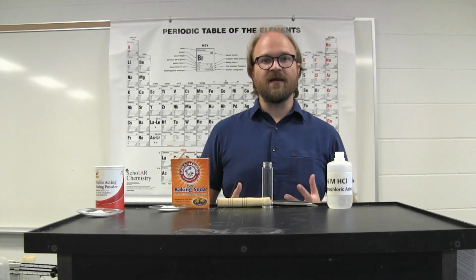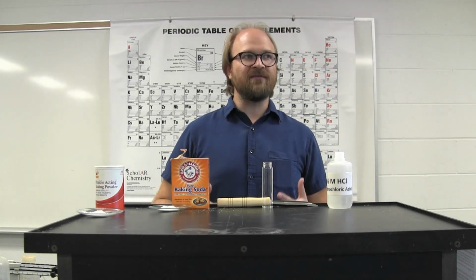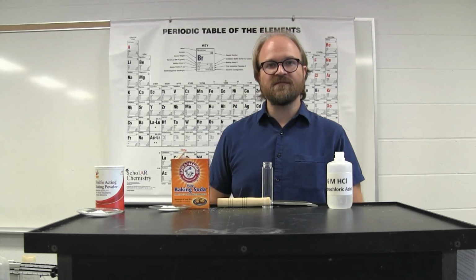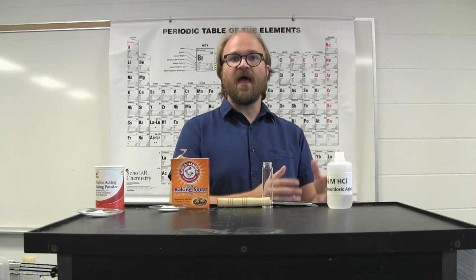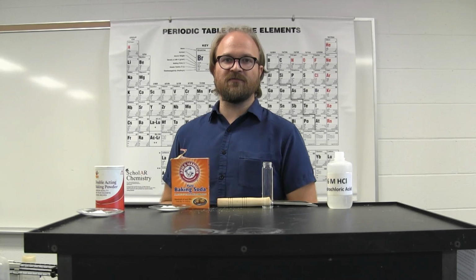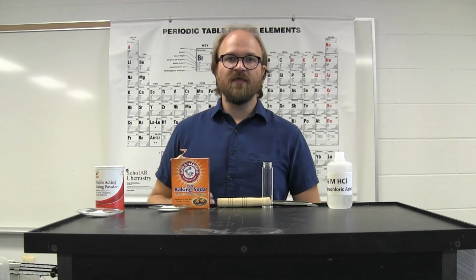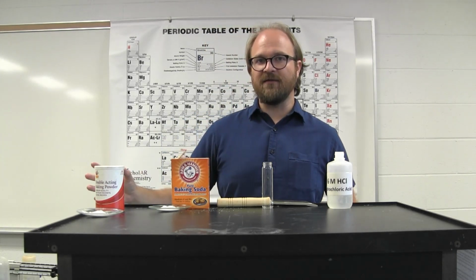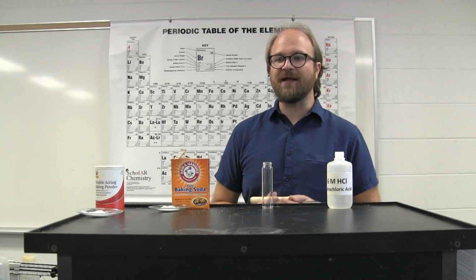Carbonate is an anion and cannot be directly measured just by weight or in labs like this. However, using chemistry, you can take something that is difficult to measure and react it to form something that is easier to measure, to form an easily measured product. Then, using the chemistry, you can back calculate to figure out how much of that initial reactant there was.